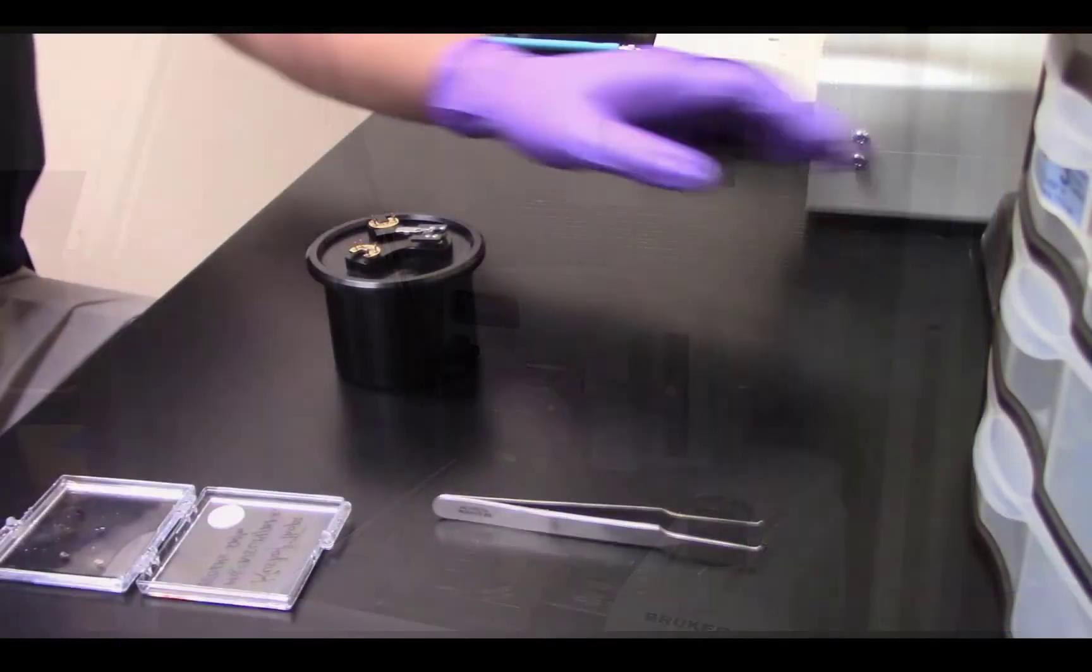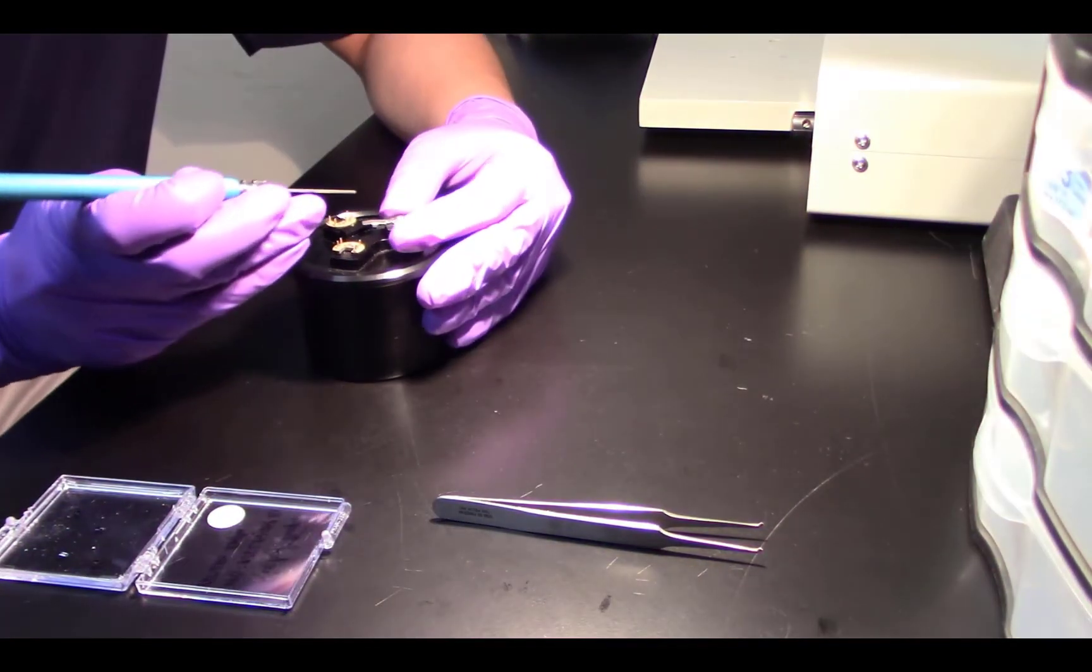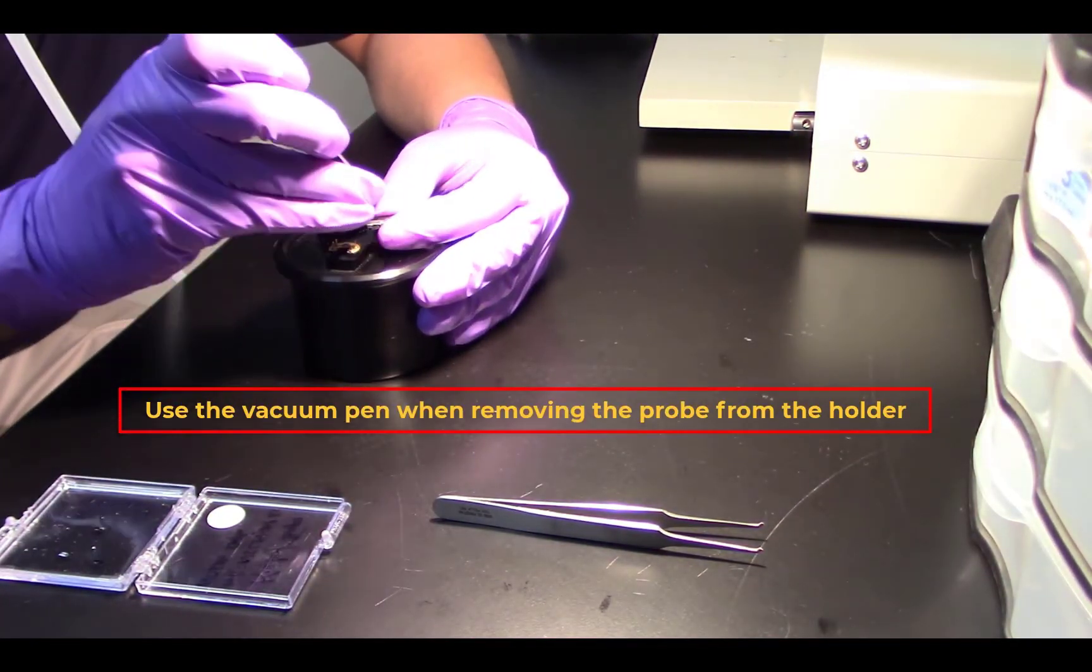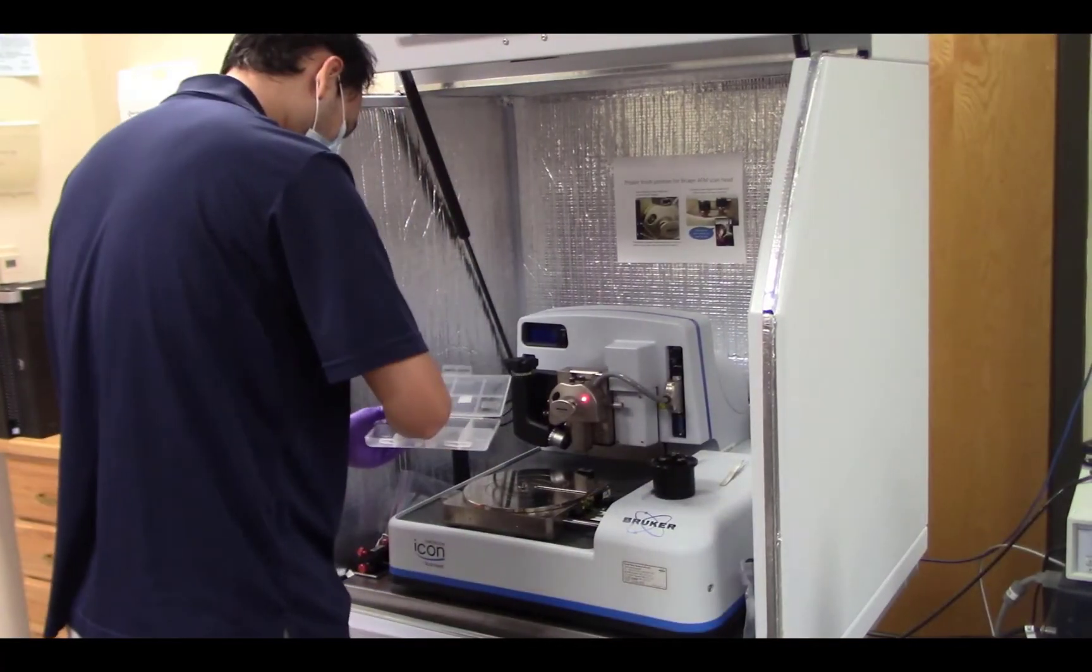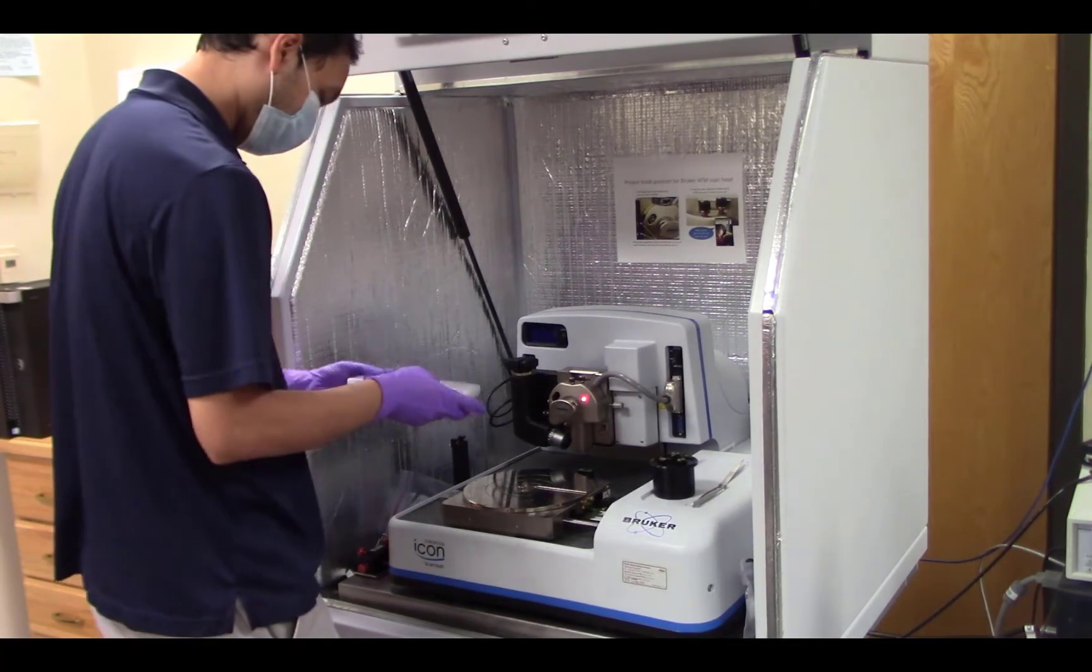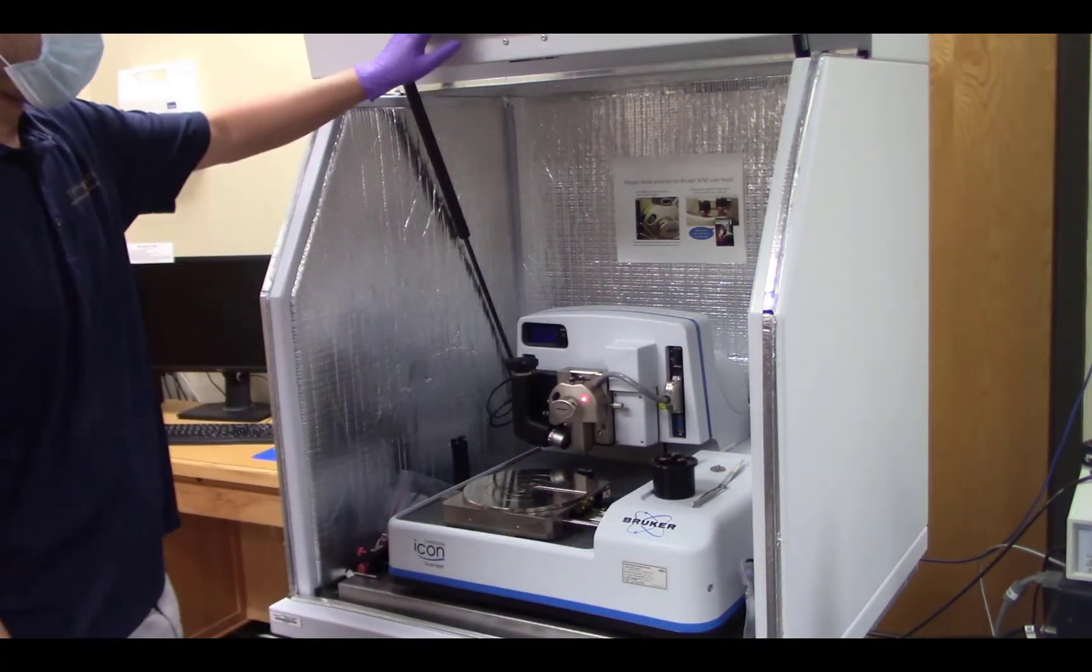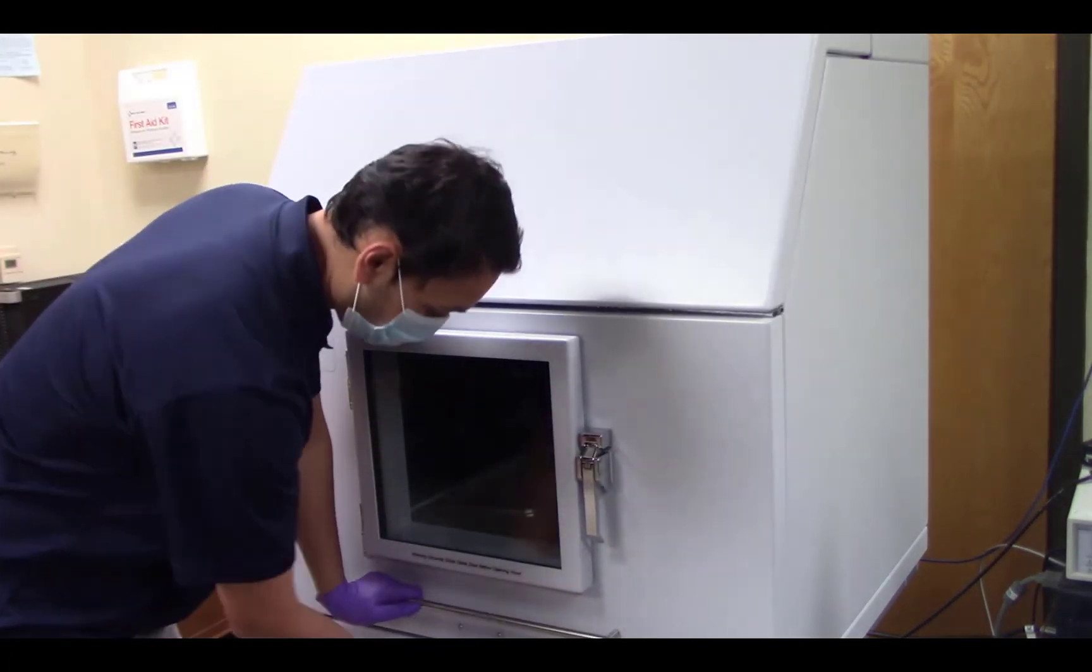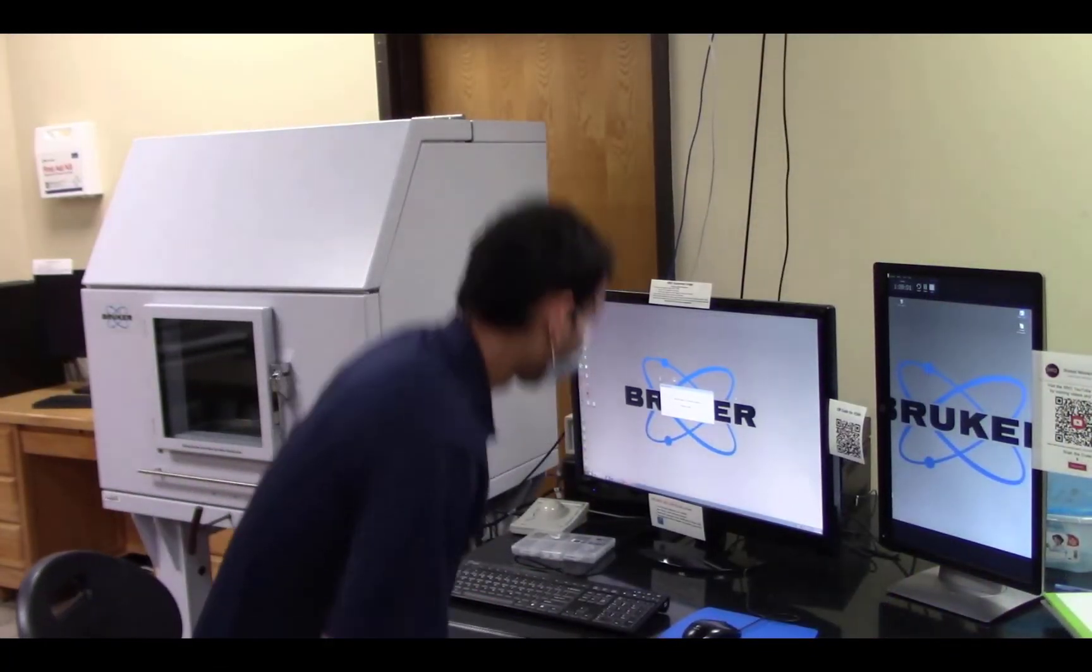Return to the preparation area and carefully remove the probe from the holder and place it in your storage gel box. Go back to the AFM and store the probe holder base in the AFM enclosure. Close the AFM door and now close the software and turn off the two controller boxes.